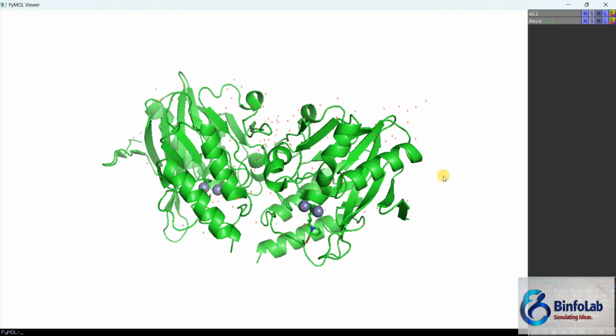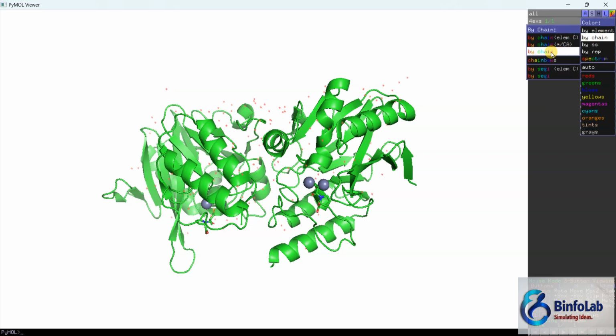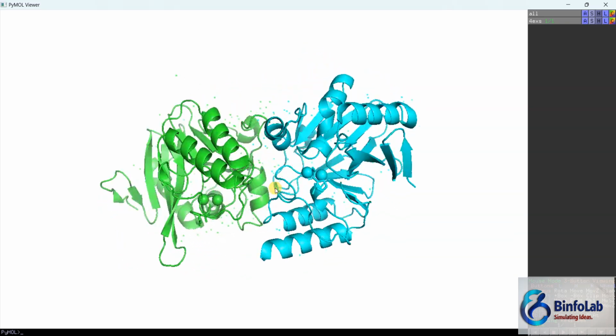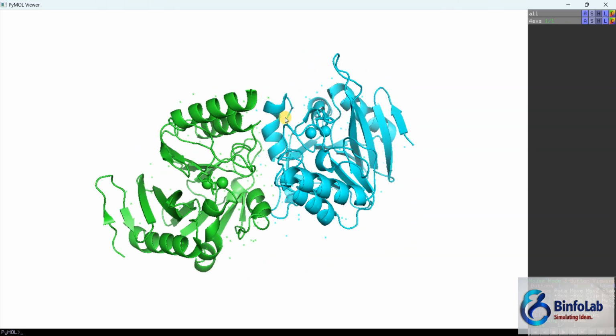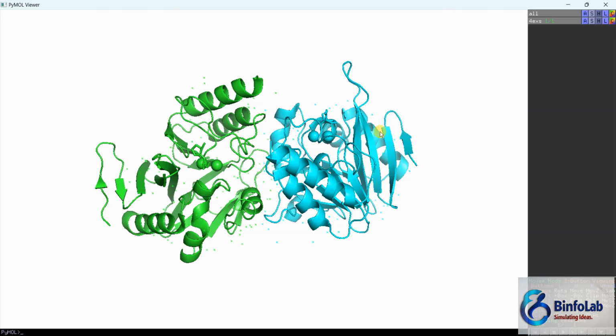Now, let me make it bigger. Okay. Now, if you see, I come here and color by chains. So you can see two chains in different colors. Now, if you are following this video because you have a protein structure or a model and it has two chains, exactly this protein also has two chains. But this protein offers an extra challenge.